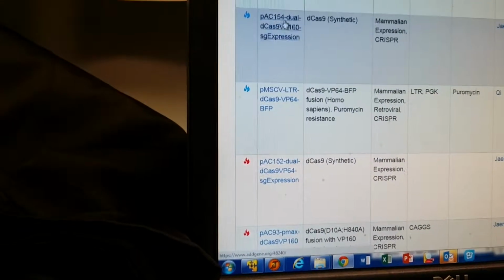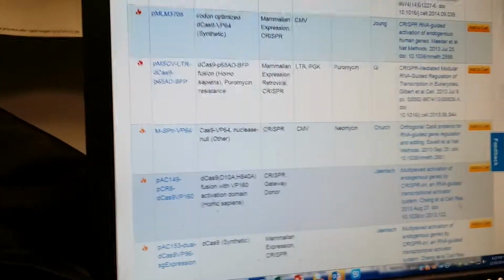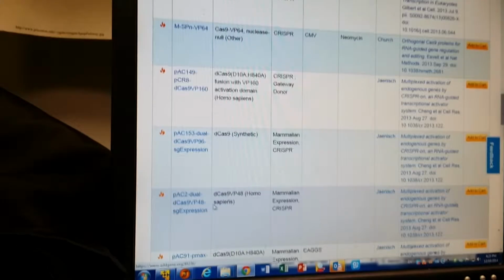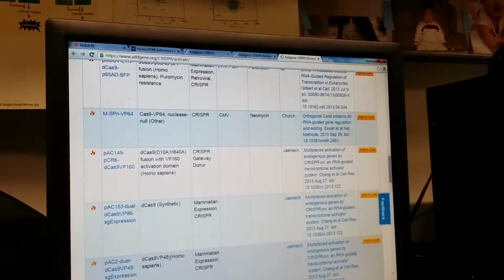There's a lot of hot ones, and cold ones. This is relatively hot, but not as hot as this one. I see. So how do you know which one to pick? There's so many. Based on your purpose, doctor. Based on what you want to do.